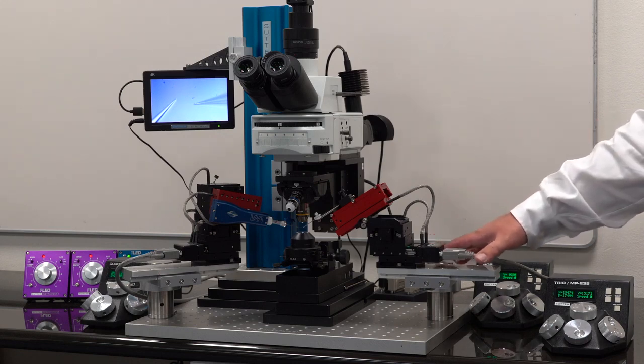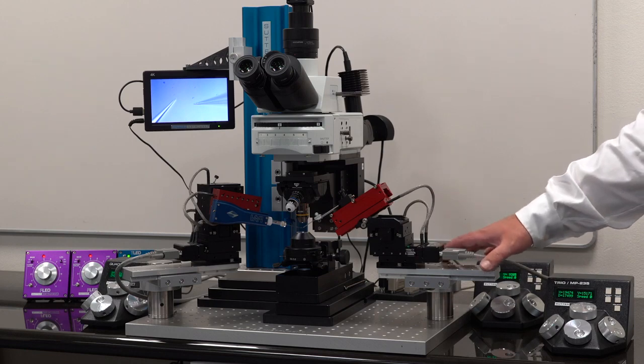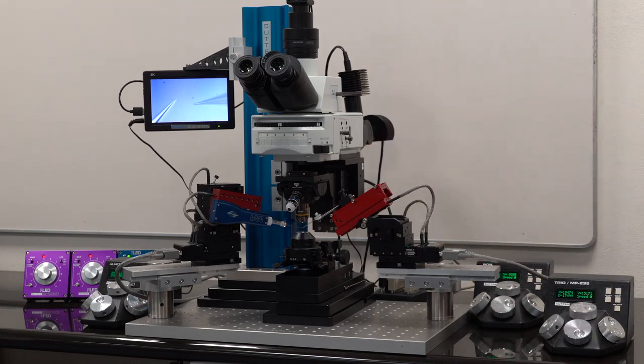We also on this system have our newer style gantries, which are the MT-95s. And my colleague Ali is going to talk about these along with the manipulators.